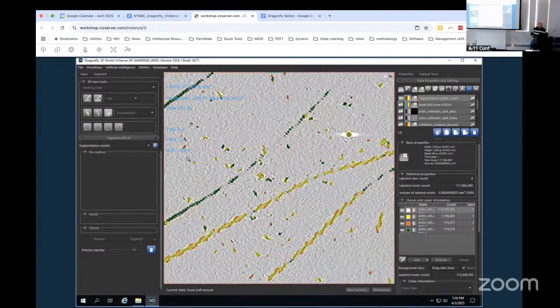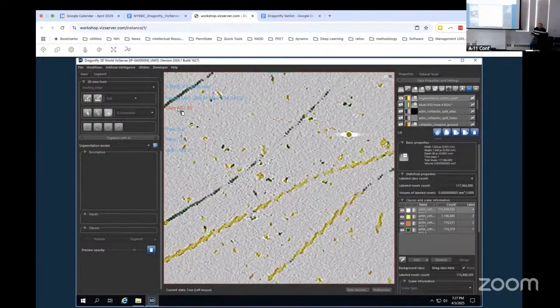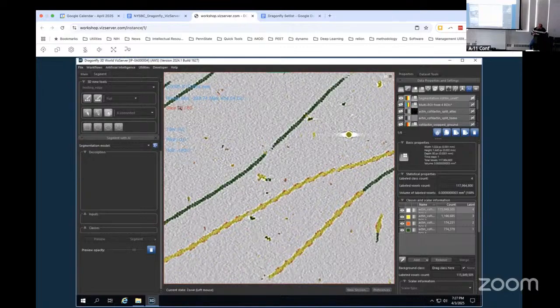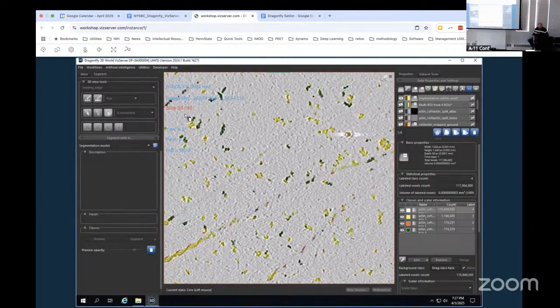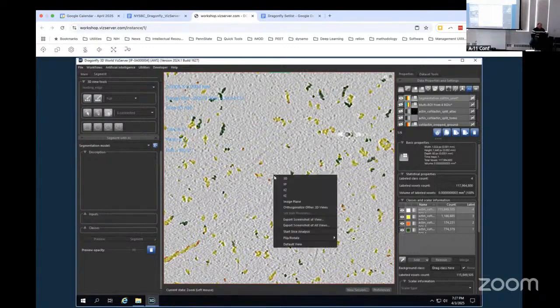It's not perfect. Probably could have trained it a little longer, but you'll see that it gets the filaments really well. And it actually starts to pick cofilins off of the outside of these. Now, there's a bunch of junk that it gets, right? Like all of these little pieces of probably actin polymers floating around. This is partly what I was talking about earlier with in vitro sets. If you scroll up and down, you'll see at the air-water interface there's this layer of just junk. What if you wanted to get rid of that junk? That was what I was going to try to do.